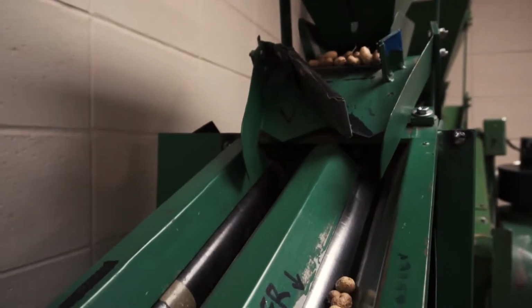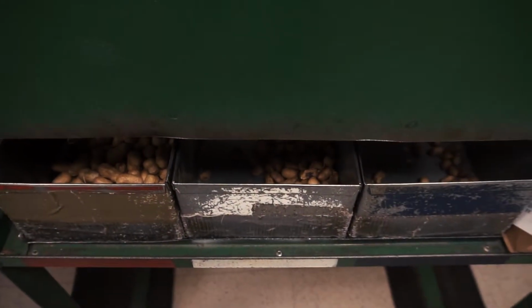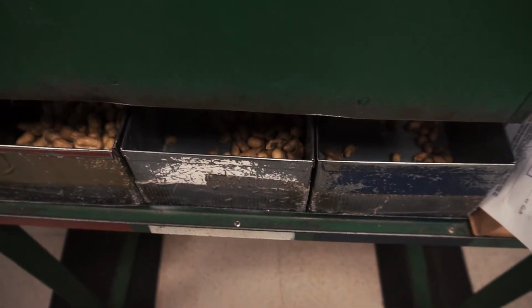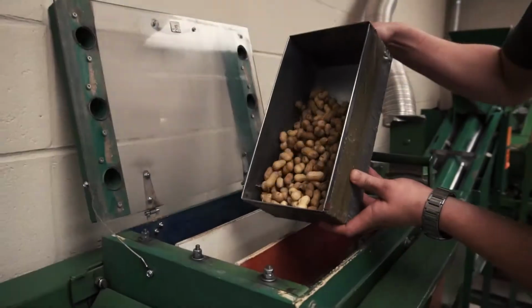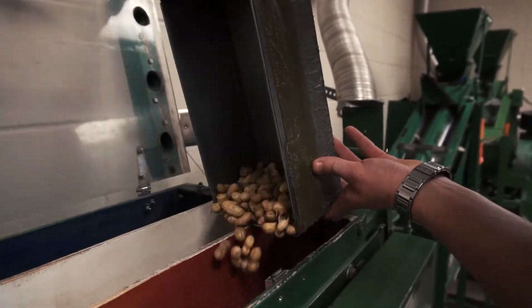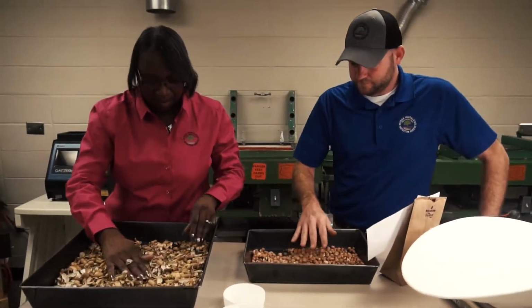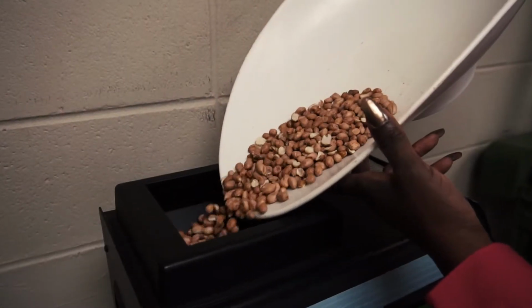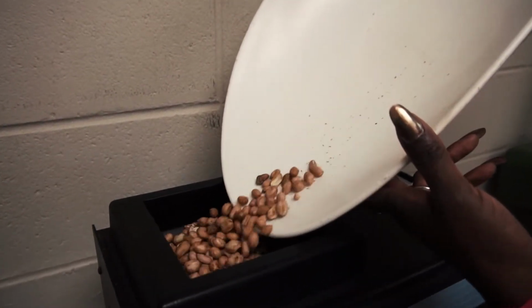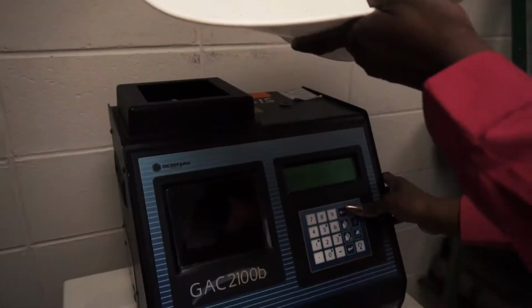The 500-gram sample is then transferred to the pre-sizer, which has rollers that sort the peanuts according to size. This machine facilitates the next step where the peanut kernels are removed from the hulls by the sheller. Any peanuts that are not mechanically shelled must be shelled by hand, and the hulls are examined to remove any peanuts. The weight of the hulls is entered into the farmer stock program. The moisture of the peanuts is determined using a calibrated moisture meter. This information is recorded into the farmer stock program.